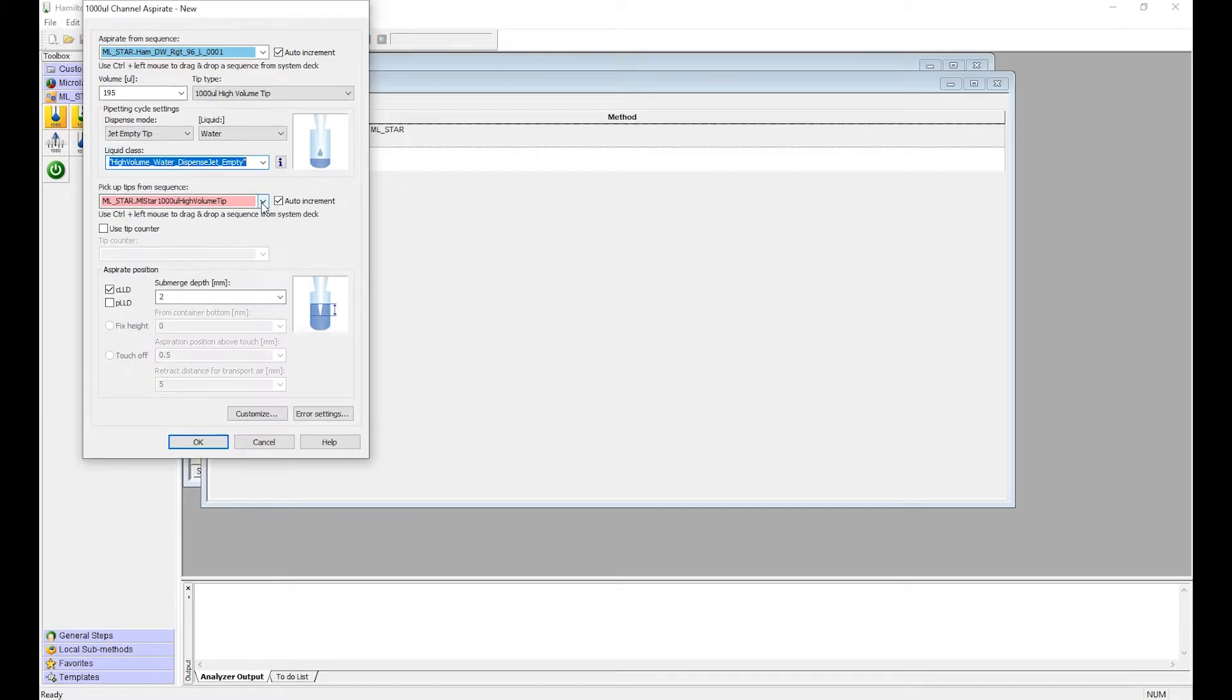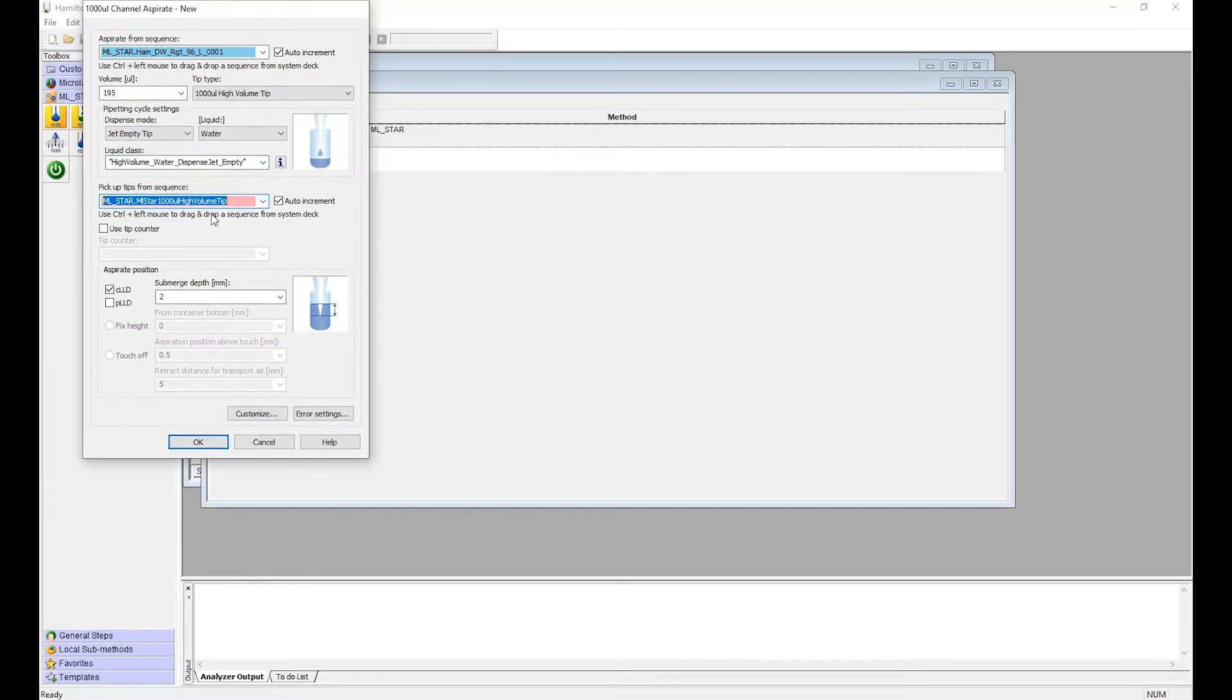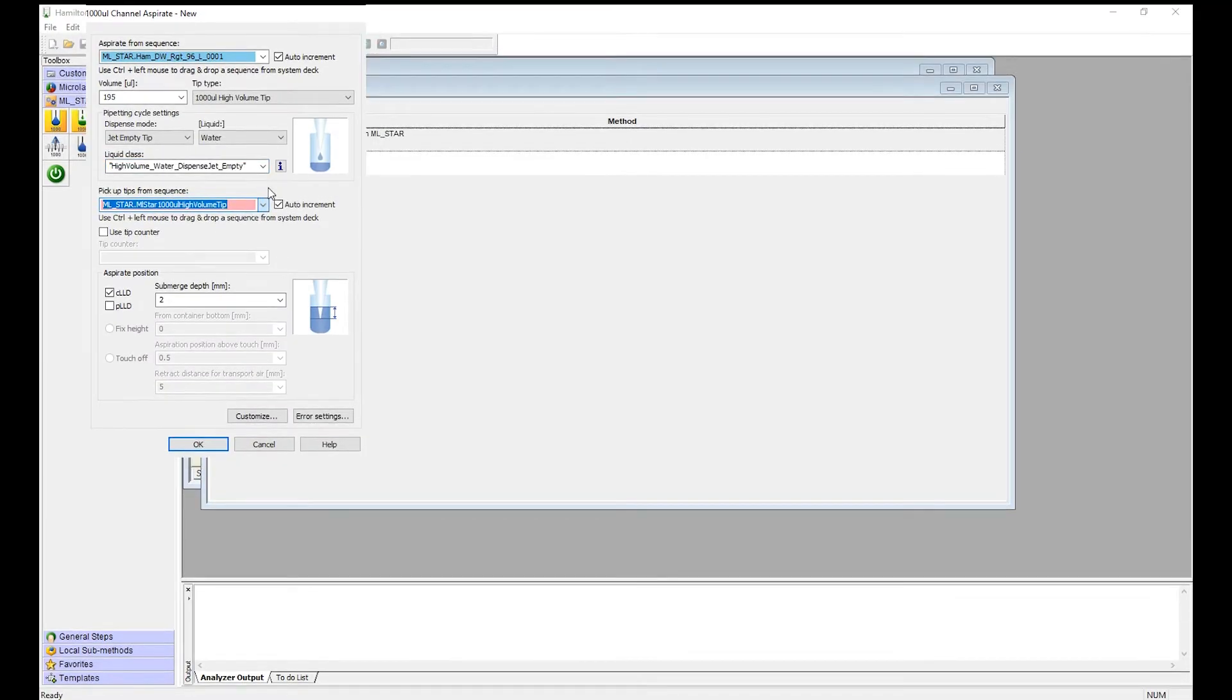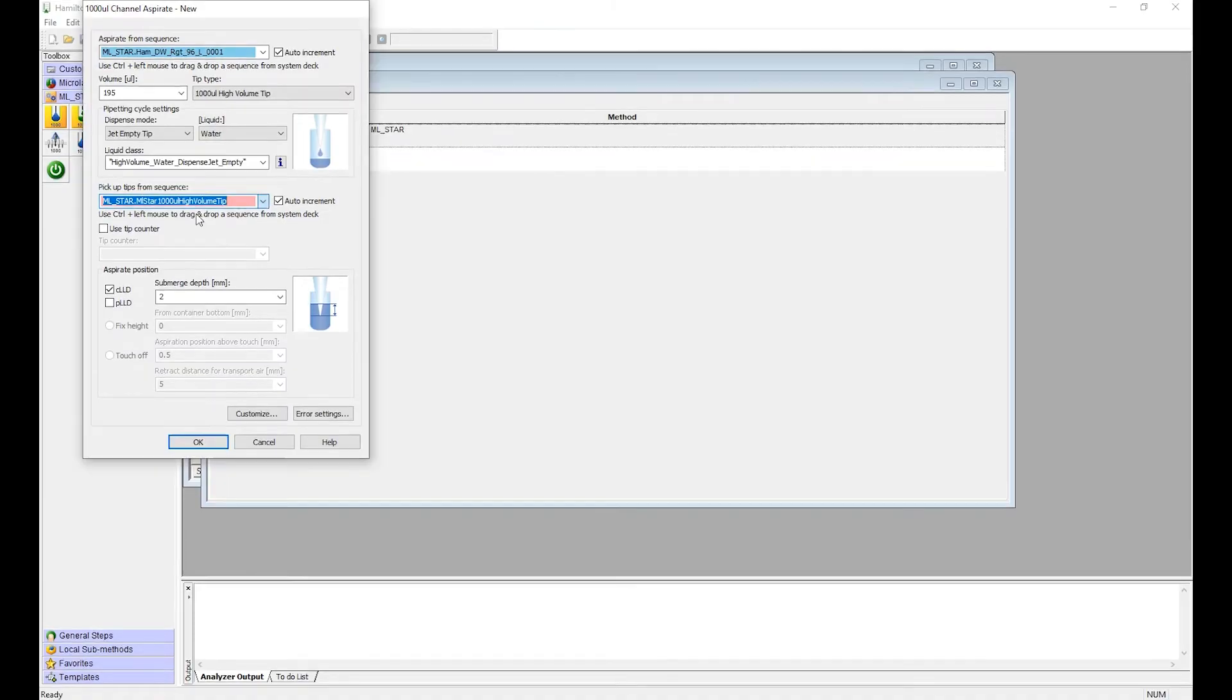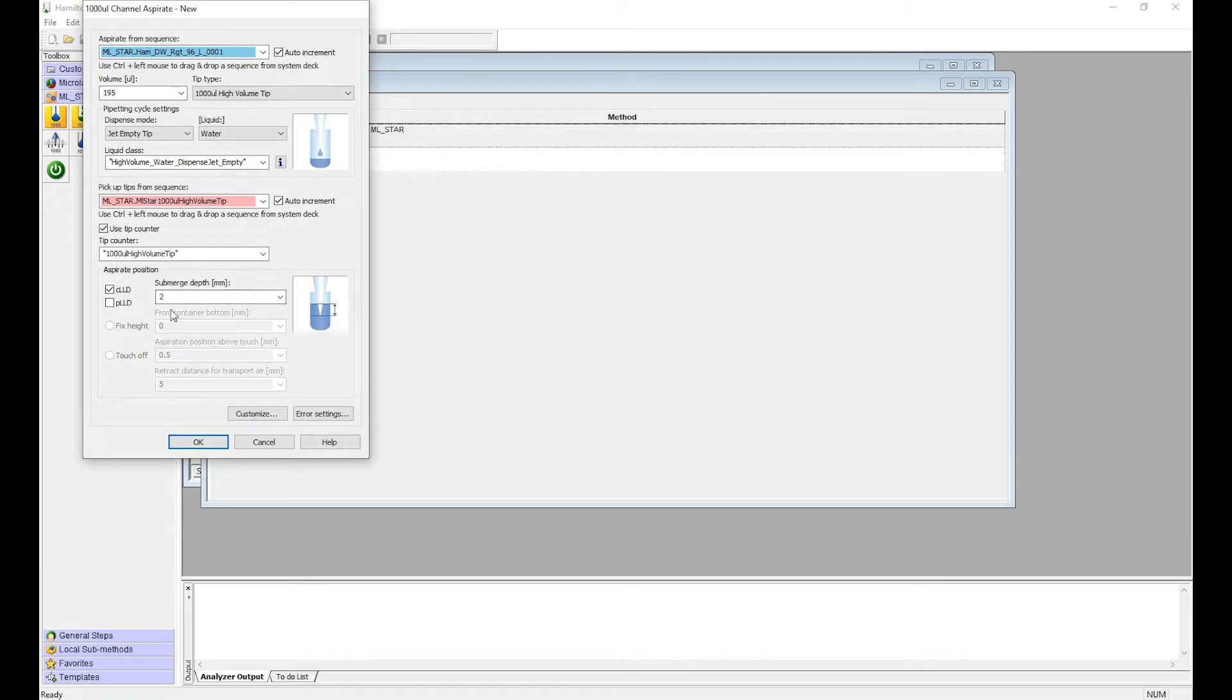Where do you want to pick up the tips from? If there's multiple sets of tips, there'll be a list in the drop down menu, but for this we're using the high volume tips. If you're doing multiple dispenses, you want to use the tip counter so it knows which tip to go to next. Now you want to select the aspirate position. This is how far it's going to go into the plate.